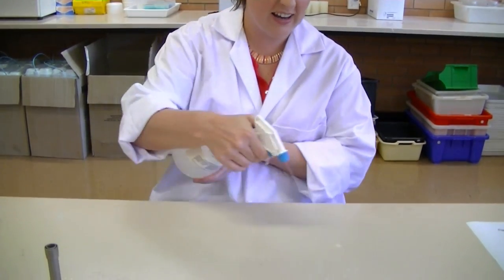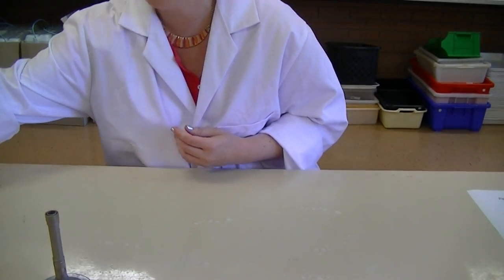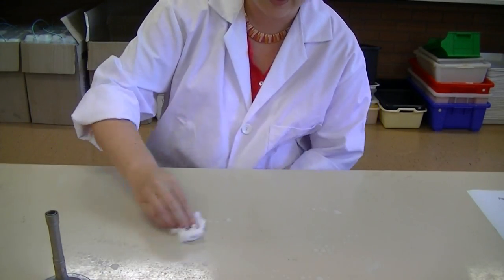To create a sterile environment, we firstly need to wipe down the surface that we're working on. You should have some bench cleaner — spray the bench with it. Bench cleaner is basically disinfectant which will remove any dust or unwanted organisms that may be on the bench.